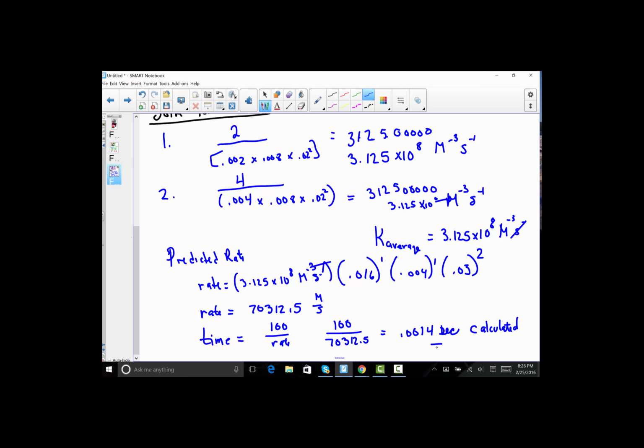Turn your page one more to page 16 and just take the difference between our observed rate and the calculated rate, which is pretty much 2 seconds, and a possible source of errors. If you didn't run the lab, I'll tell you possible sources of error. Not sure exactly when to end the timer, because the reaction, if it didn't instantly turn blue, it faded to blue, and sometimes students were unsure where to end the timing.